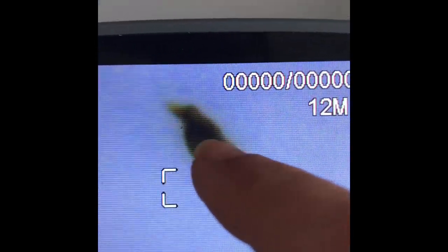This is another nit and it has that same egg shape form with the little end of glue pulled off with it. This nit is a little bit different - notice it is more clear and there is no bubbly cap on the end. Instead it's concave, which could mean the cap hatched open and the nymph, which is a baby louse, crawled out into the person's hair - or the nymph is actually dead in there. Lice lay both fertilized and unfertilized eggs, so about 77 percent of eggs will hatch. Lice lay eggs twice a day, about three to five at a time, so they can lay up to ten eggs a day.